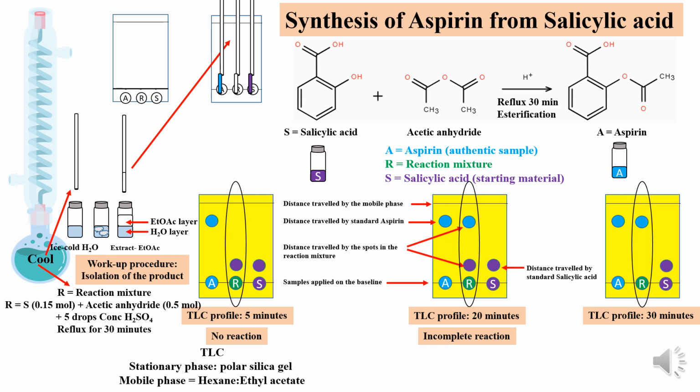And we don't find any spot for the starting material, that of salicylic acid. So you can conclude that the reaction is complete. So now you can work up the entire contents of the round bottom flask. The entire reaction mixture contains the round bottom flask.